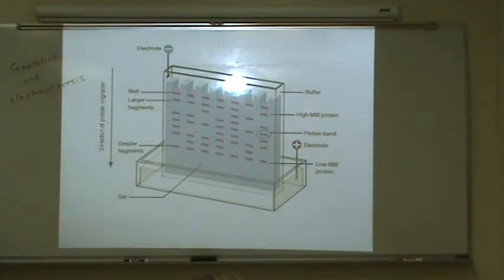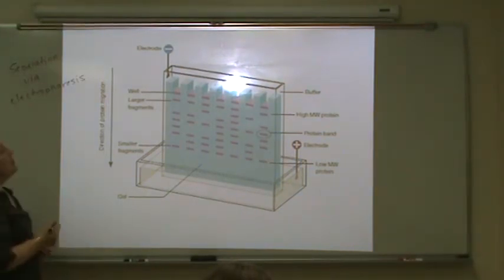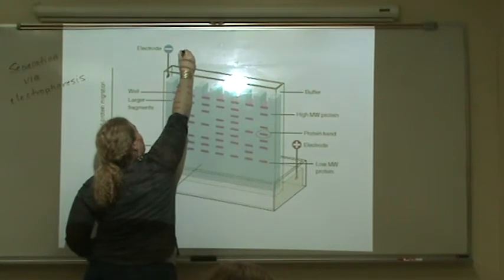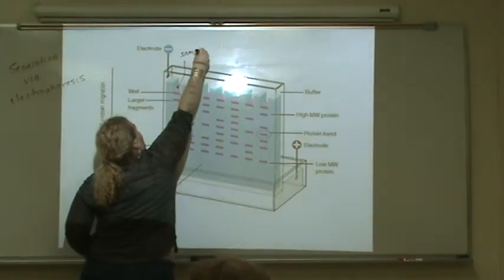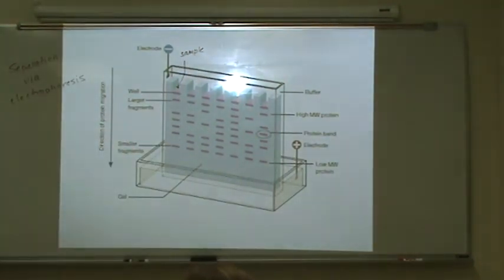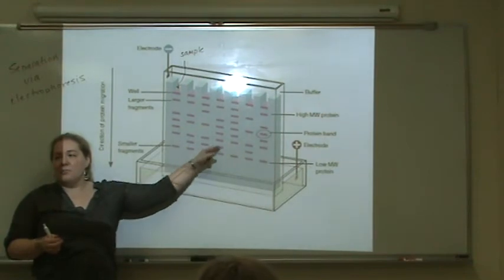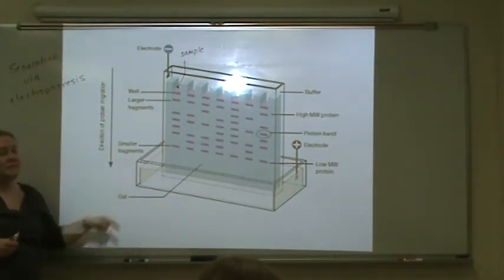So what you're going to do is take your samples and load them into a gel. And you probably would have multiple samples. If you're going to go to the trouble to make a gel, you usually have multiple types of samples that you're interested in.